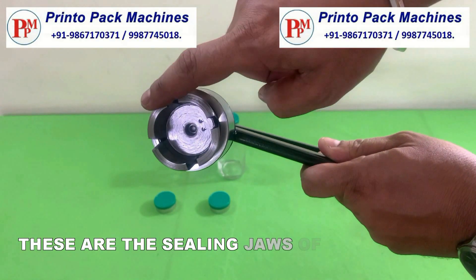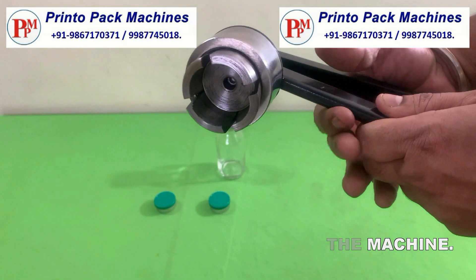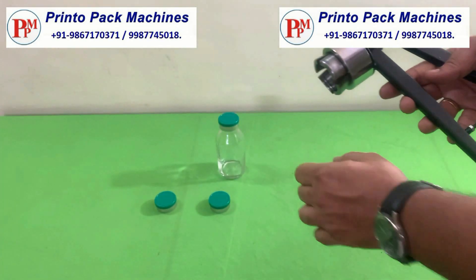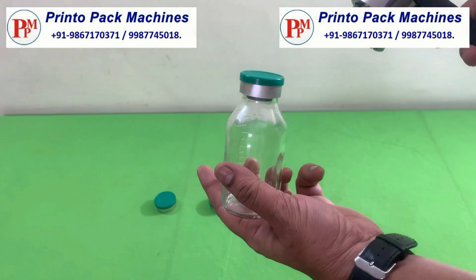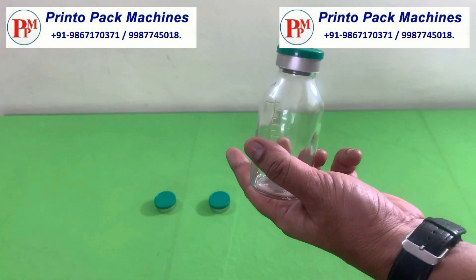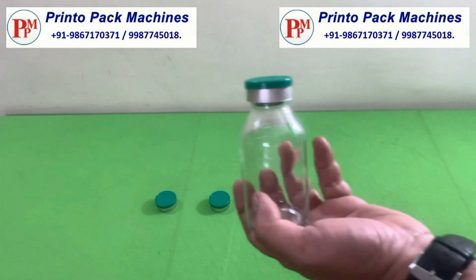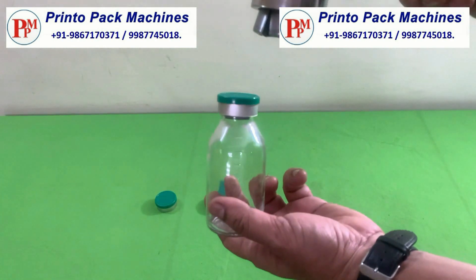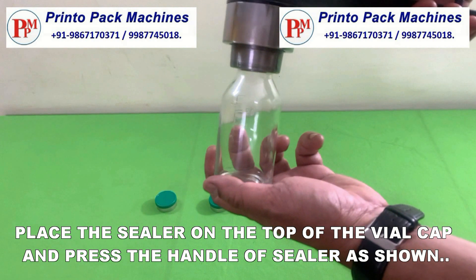These are the sealing jaws of the machine. Place the sealer on the top of the vial cap and press the handle of the sealer as shown.